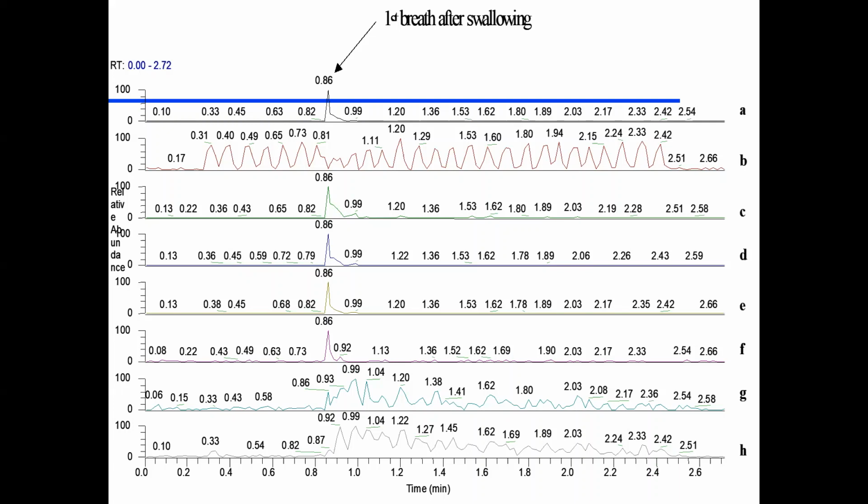But these 2 down here are much heavier, much less volatile. They don't all come out immediately. You get a little bulk, and then okay, a little more, and this tails on. This is aftertaste. So what you sense after you swallow it, your bright, fresh flavor compounds have gone away. They're no longer in your system unless you swallow again with some orange juice.